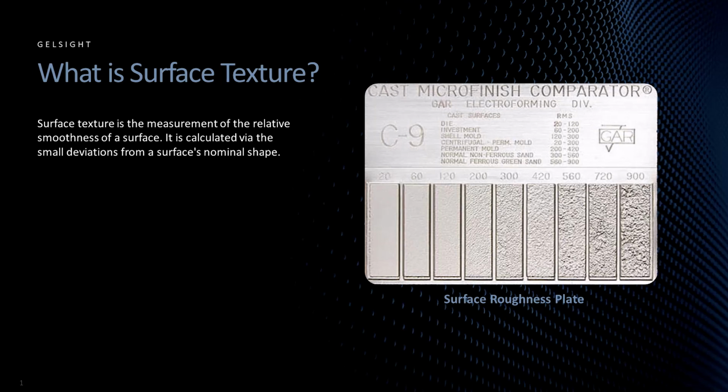Also, rough surfaces tend to wear faster than smoother surfaces. However, manufacturing costs can quickly skyrocket as the required roughness is reduced. So it's very important to know what level of roughness is required for the component that you are manufacturing.